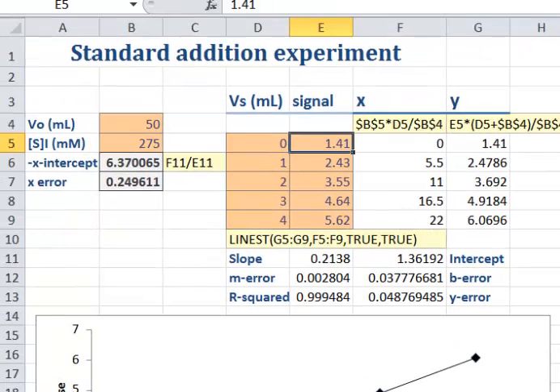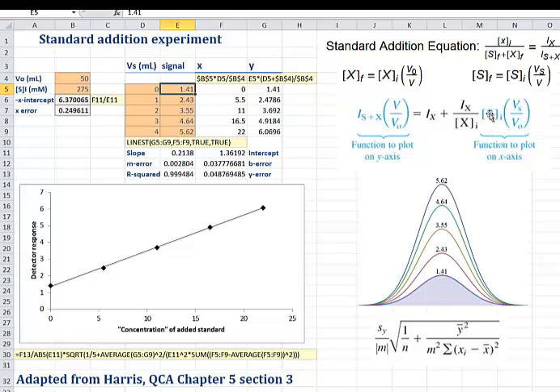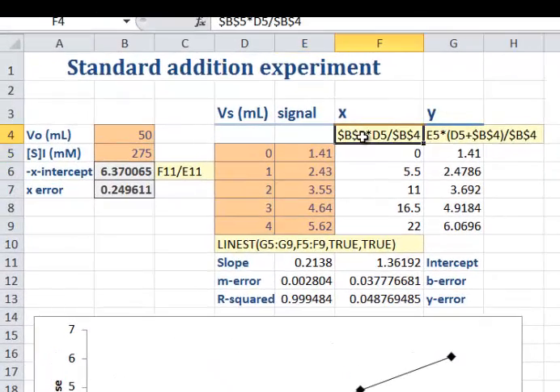Now, the X column needs to be this equation right here. It needs to be this quantity, which is the concentration of the stock solution multiplied by the ratio of the volume of the stock solution and the original volume. So we see here that I've got B5, which is the concentration. D5, for this first one, is the volume of the stock solution added, which is 0. And then B4, which is the original volume, which is 50. Naturally, since there's a 0 there, that should be 0. But as we move down to the subsequent equations, we get a value that seems to make sense.